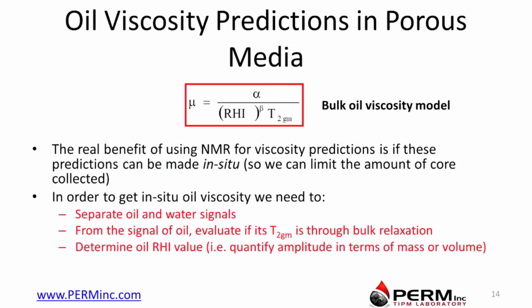Now, what we would like to do is be able to predict viscosity inside the porous media. So not just as a bulk liquid, but how can you predict in situ viscosity during something like a logging tool characterization of your oil sand system. So essentially what we would like to do is use this bulk oil viscosity model to measure viscosity of in situ fluids.